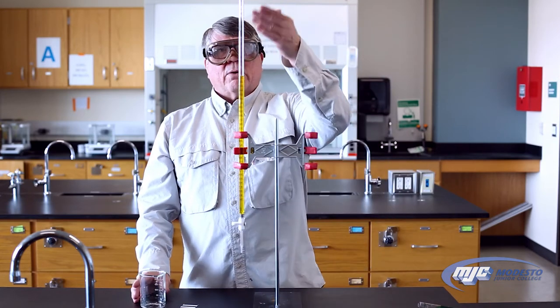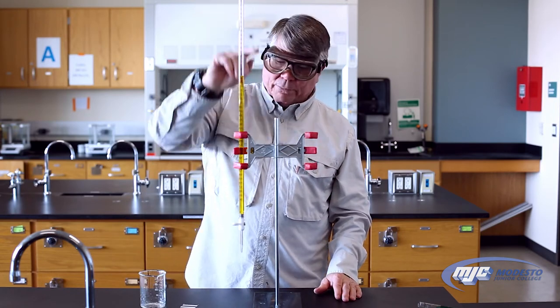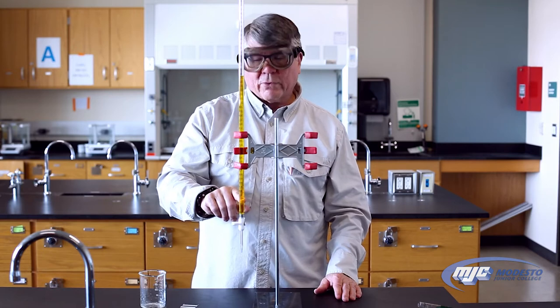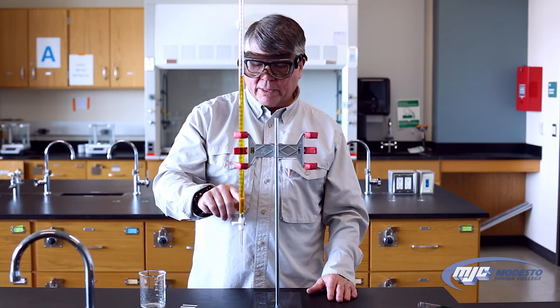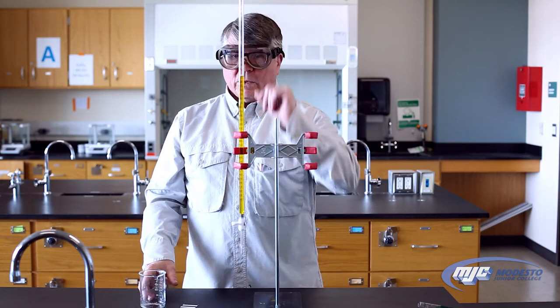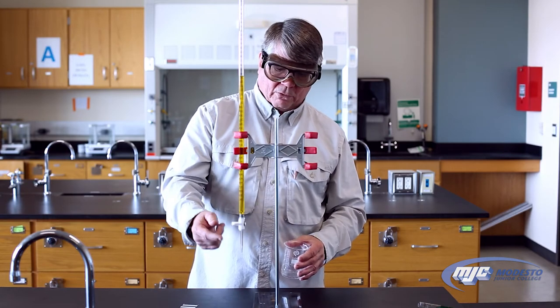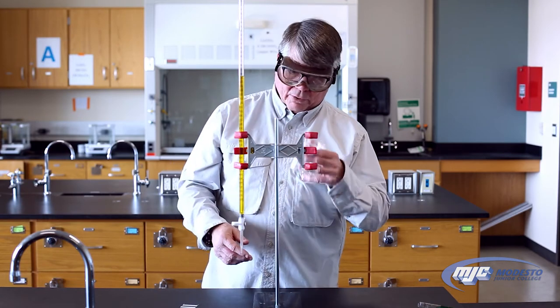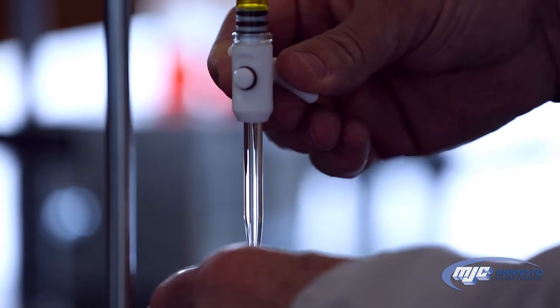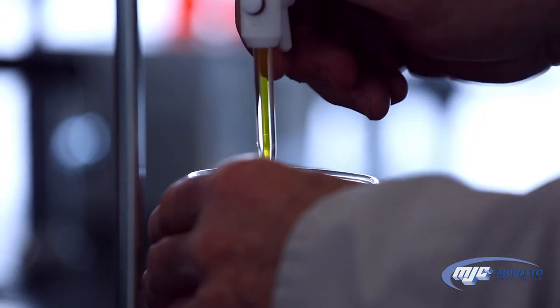Then fill up the burette with that solution. The zero is at the top and the largest volume is somewhere down towards the bottom but not all the way at the bottom. Once you fill up your burette with your solution, there's still going to be air in the tip. You need to get that air out. So take your waste beaker, open up the stopcock and flick it until all the air bubbles get out, and then stop.